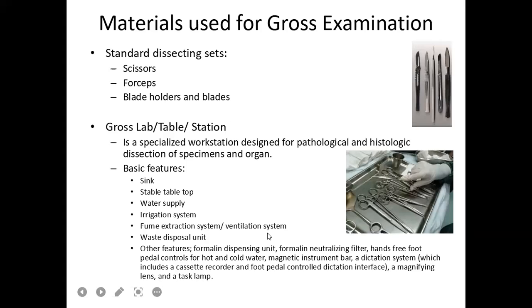Waste disposal unit. And for some other gross tables, may include formalin dispensing unit. So, meaning there is like a hose, no, for dispensing the formalin for preservation of specimen. Formalin neutralizing filter, hands-free foot pedal for hot and cold water, magnetic instrument bar, a dictation system, like for example, while you are describing the specimen, no?